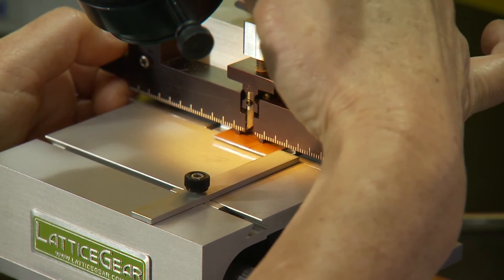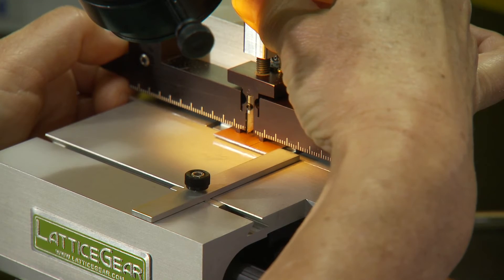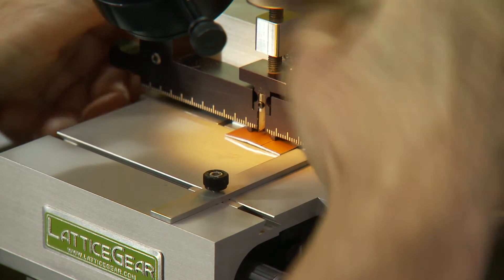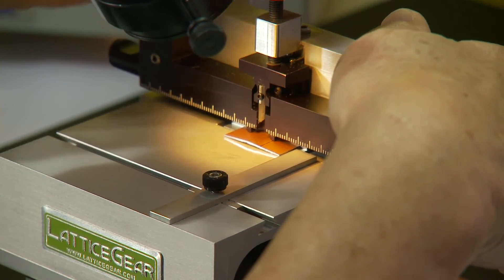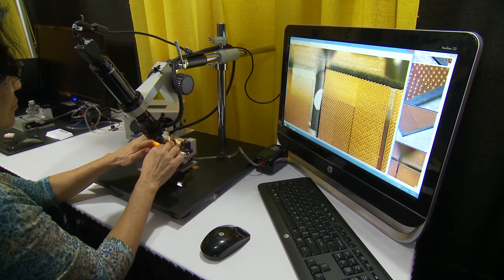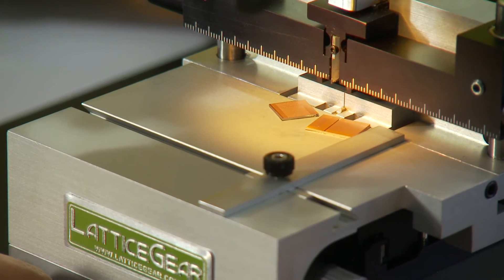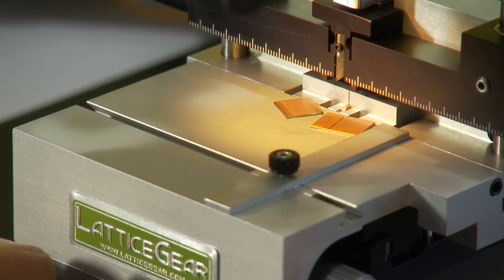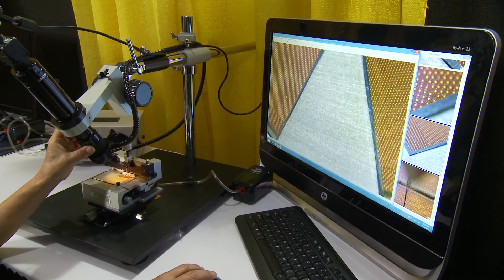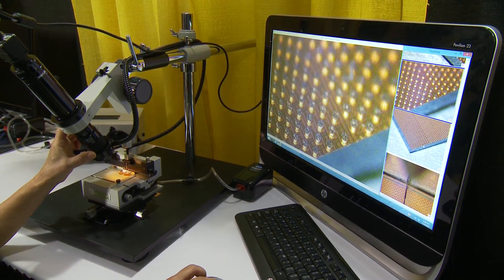The cleave is a slow, controlled cleave, and thereby a high-quality cross-section. The results: a straight, clean cleave line starting from the very leading edge with no dust or pieces. Both cross-section samples are clean and accurate. Looking at the surface of the cross-section, we can see a mirror finish quality, which is evident of the high-quality cross-section.